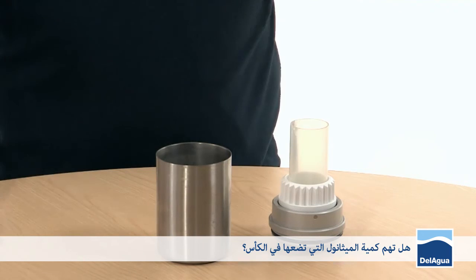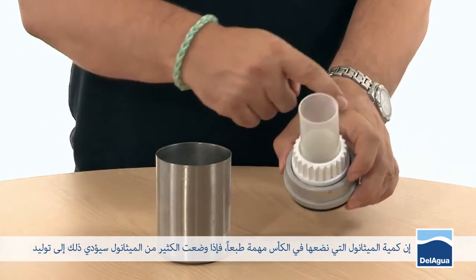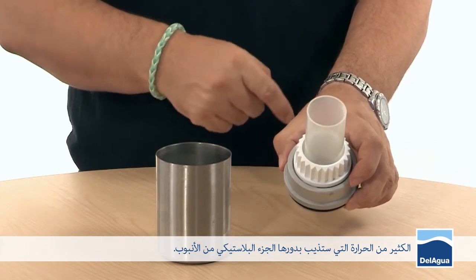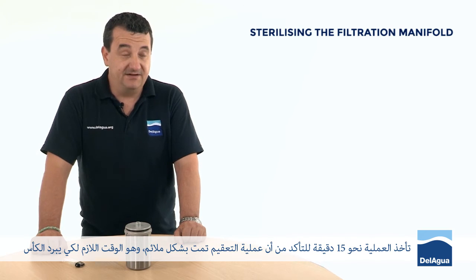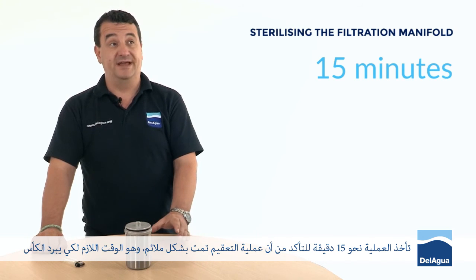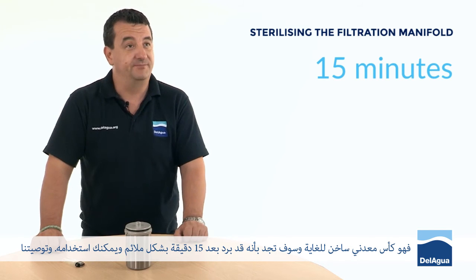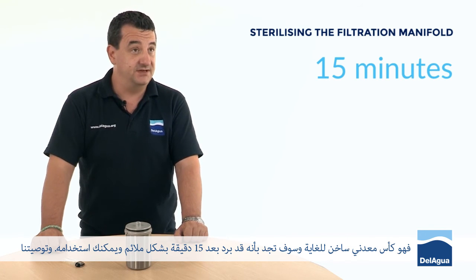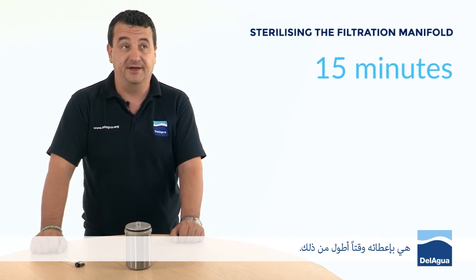It does matter how much methanol you put into the cup. If you put in too much, it can create too much heat and that can melt the plastic part of the funnel. Now you've cut the oxygen off to the methanol — how long do you leave it to sit before you can process a sample? It takes about 15 minutes to ensure proper sterilization. Most of that is allowing it to cool down sufficiently to be able to touch it, as it's a very hot metal cup. Recommendation is probably to give it a little bit longer than that.